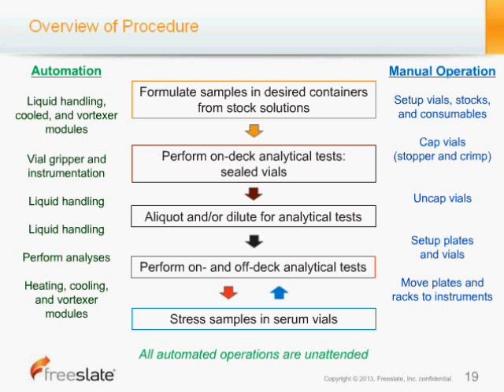And then a key note here is that all of the automated operations are unattended. So once you set up your liquid handling or your instrumentation, or you want to perform your analyses, or you want to perform your stressing, you just set it up and you go. And it keeps track of what has been done to each plate.